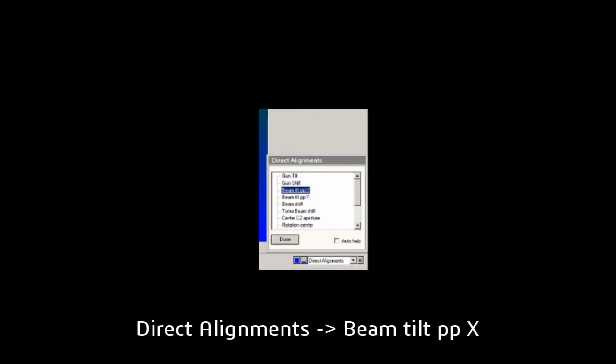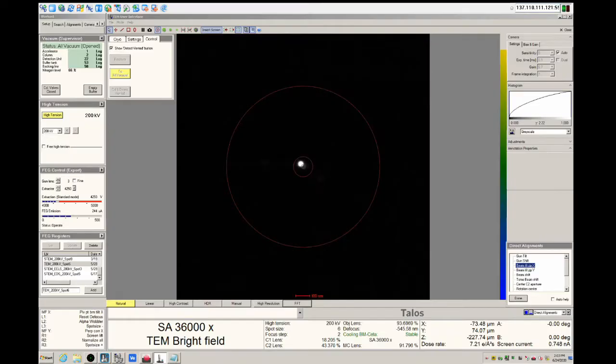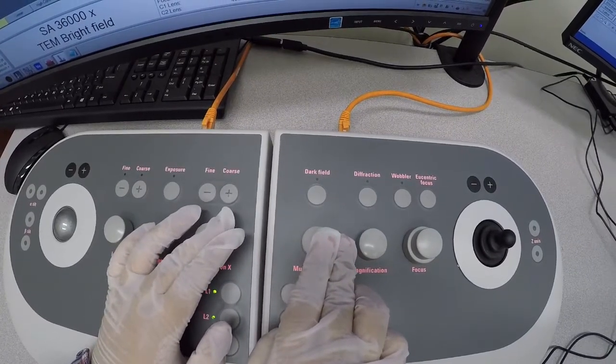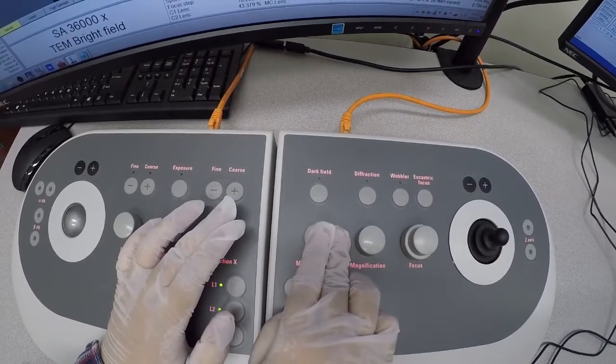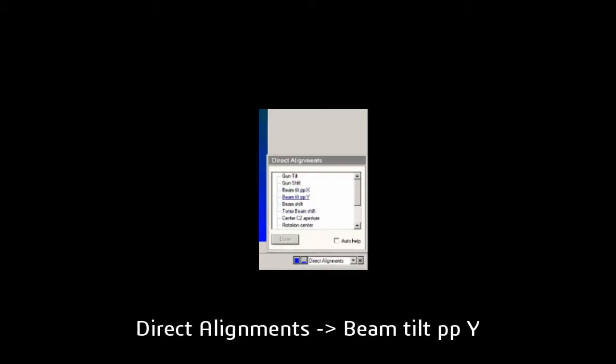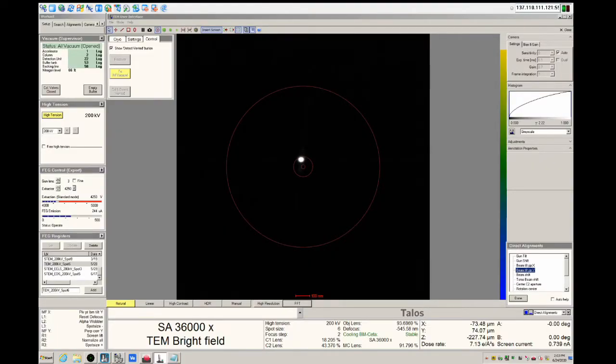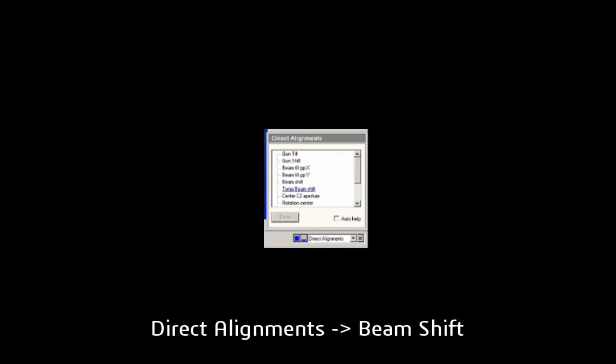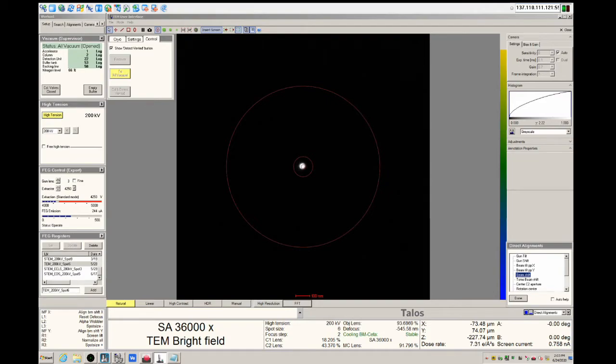Whenever you turn this on, the spot will look like it wobbles on the screen. You then use the multifunction X and multifunction Y dials to minimize the wobble. We then repeat this procedure for beam tilt PPY. It's good practice to continually touch up alignments as you proceed. So again, we're going to go back and adjust the beam shift direct alignment.